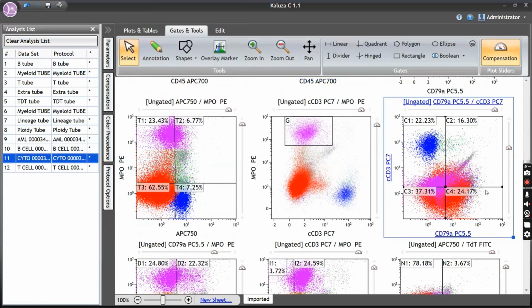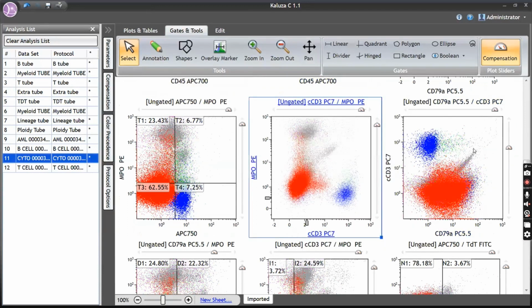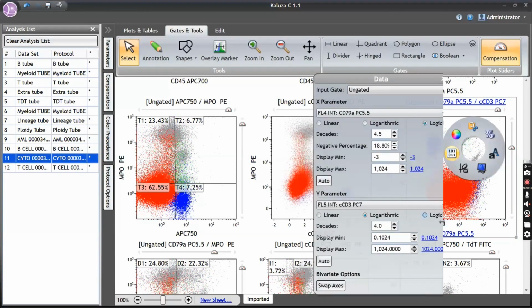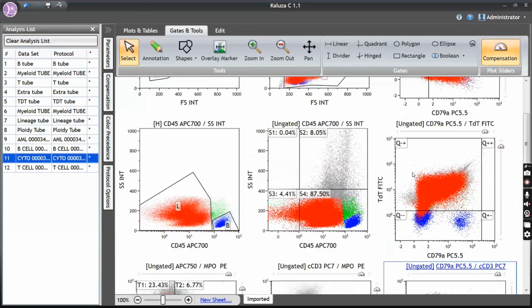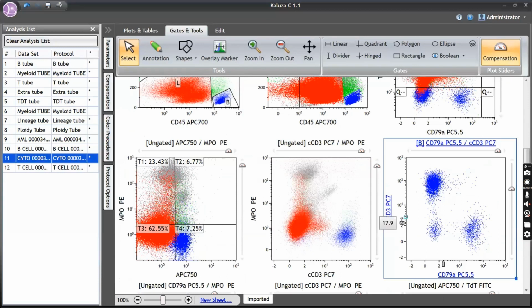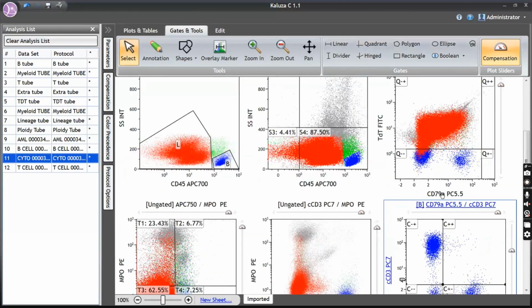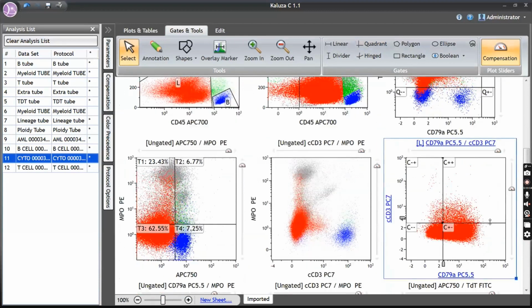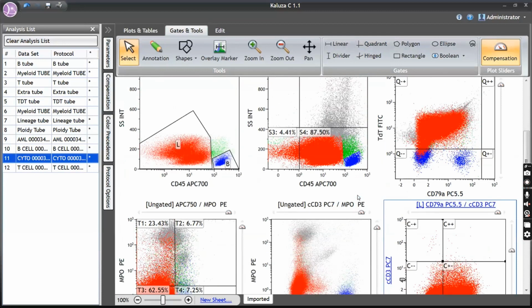Okay, 79A. I'll take this off. 79A, what is the intensity? Positivity, positive or negative? Now I've drawn with the control. So let me draw a quadrant. Shall I drop the blast now? So 79A is heterogeneous and it is positive.